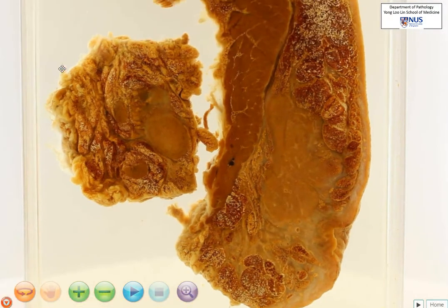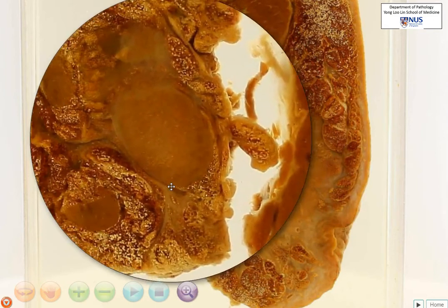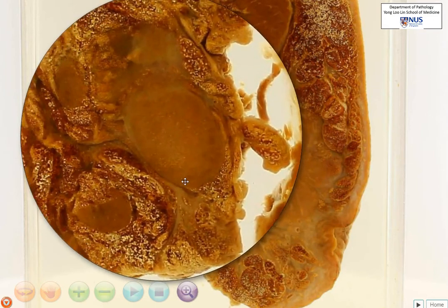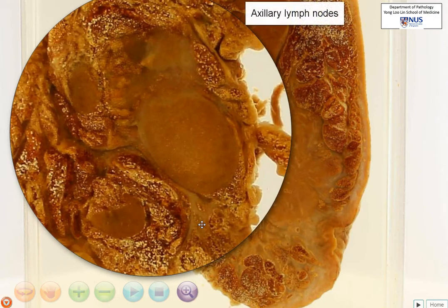It is probably causing retraction because of a little bit of the stromal reaction deep to the nipple. Now, we talked about this other tissue piece that is separate. If you look carefully, you can see that this is adipose tissue, which looks very much like the adipose tissue in the breast parenchyma. And we see a few nodules — if you look carefully, you can actually pick out a couple of other nodules over here. And this is, in fact, axillary tissue with the presence of some axillary lymph nodes.